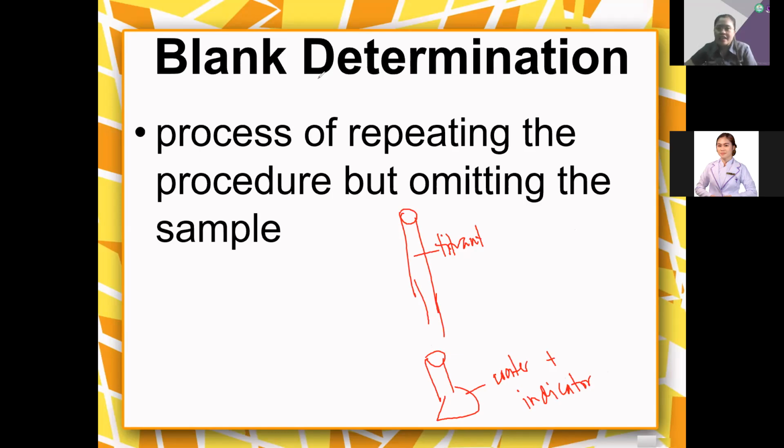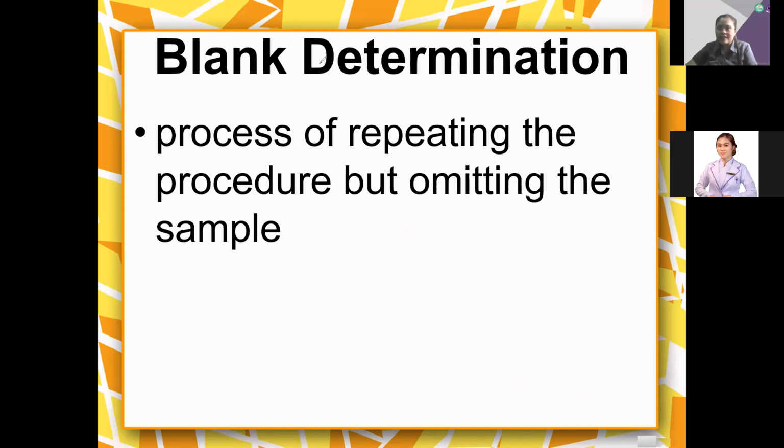Ginagawa talaga yan siya to compare results of titration sa merong sample and sa walang sample, baka may variations or may biases along the way. That's when we are asked to do blank determination.